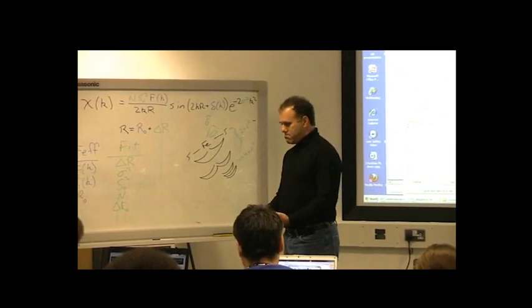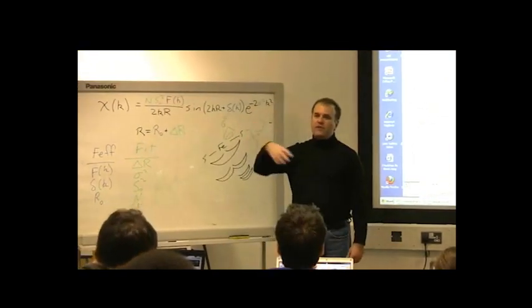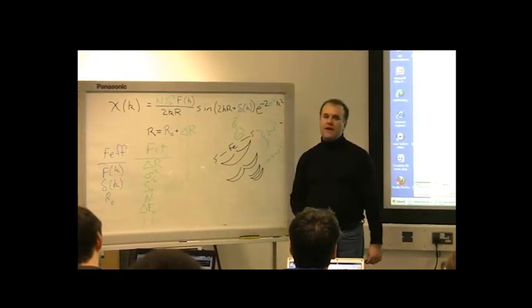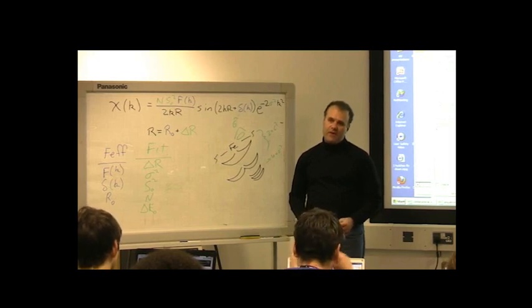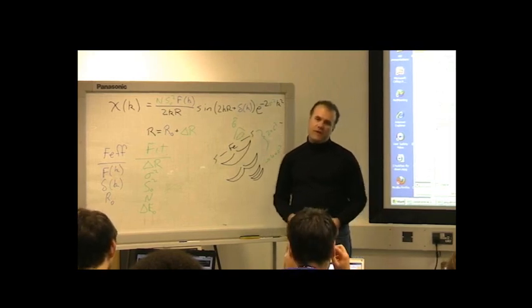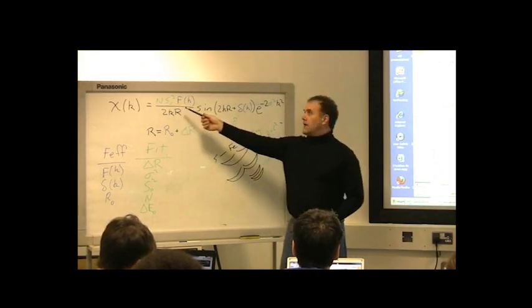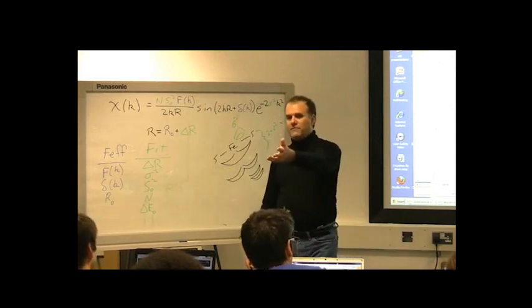So there are some problems for which you can't measure them independently, and so what people often do is exploit what you said, and there's a phrase in the EXAFS literature for what you just said. It's called chemical transferability, where we say that S0 squared is the same for everything of the same atom. So what you might do in that case is measure a palladium foil for which you know n, get S0 squared as something you evaluate, and use that in your subsequent fits for the value of S0 squared. That is a common thing to do.